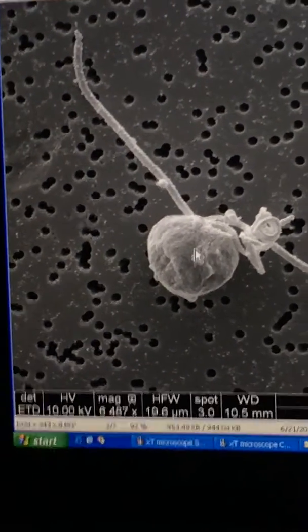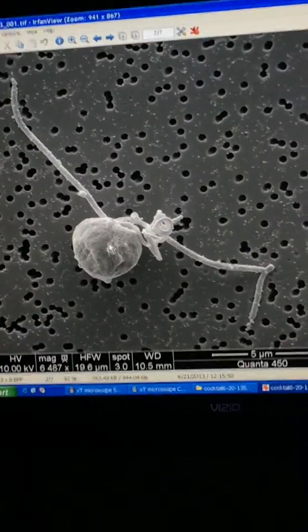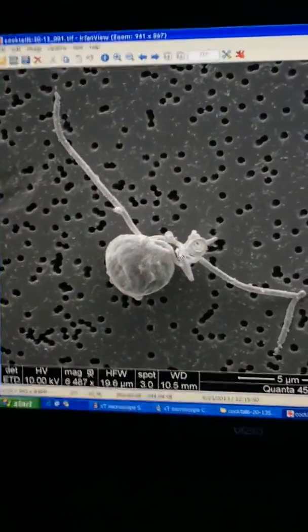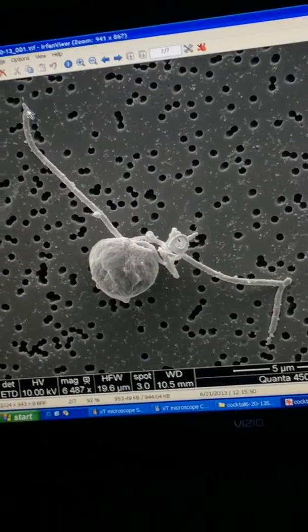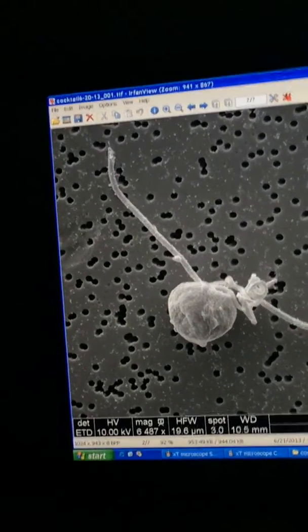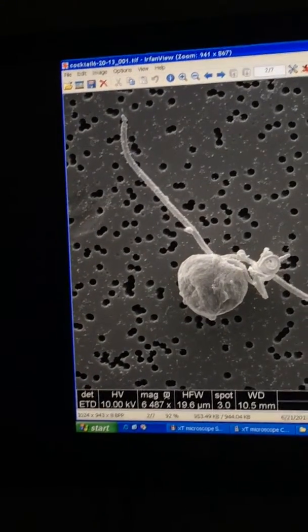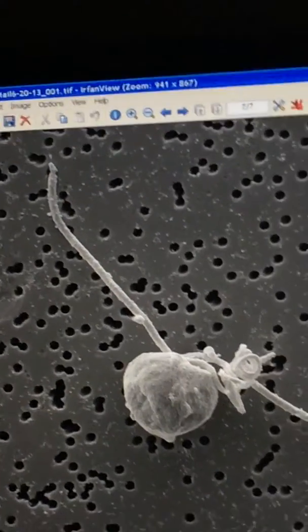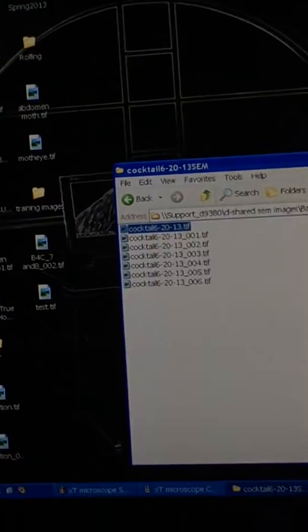So even though they're photosynthetic organisms, they also have this ability. They're also phagotrophic. They can eat things and survive on that. So this would be its form when it's all coiled up, and when it's extended, it can be 3 times the length of these flagella, so it can be quite long. And it swims. One form of swimming is to have this thing extended either in front of it or behind it, with the 2 flagella off to the side, so it kind of floats with this thing sticking out. See, all these things you won't learn anywhere except talking to an algae person like me.